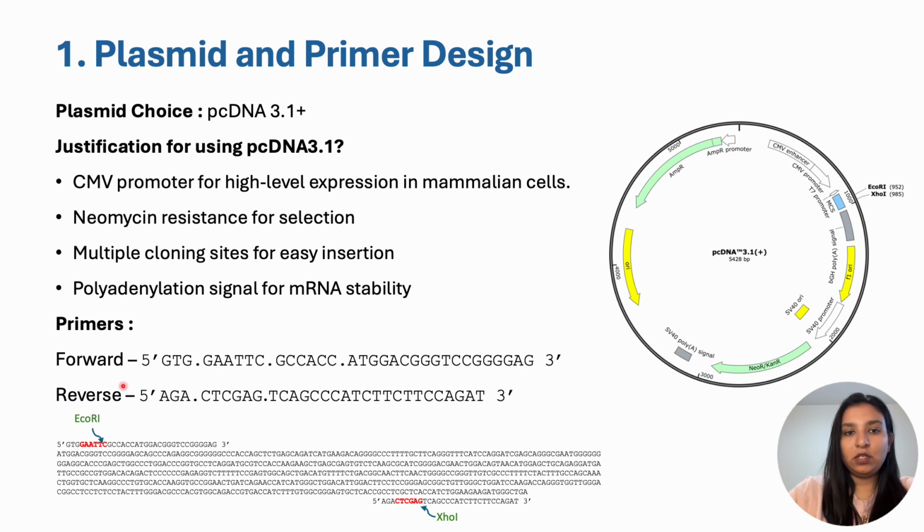And here I have designed forward and reverse primers with EcoRI and XhoI as restriction sites for cloning. And this forward primer also has a Kozak sequence to enhance the translation efficiency.